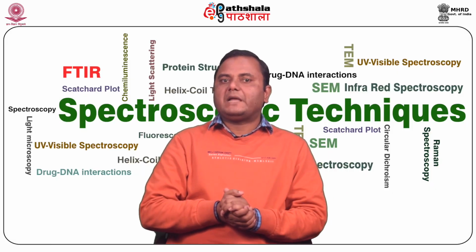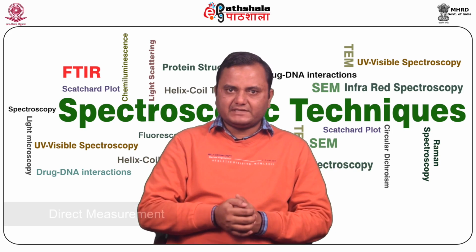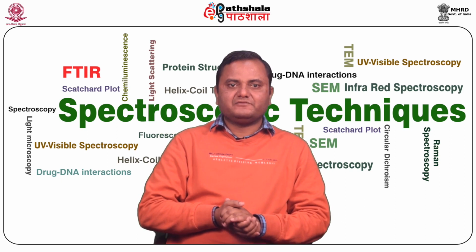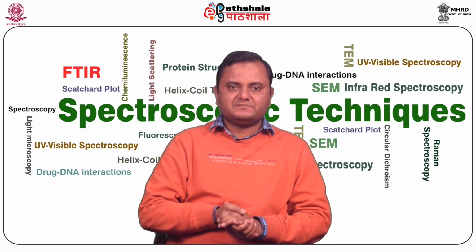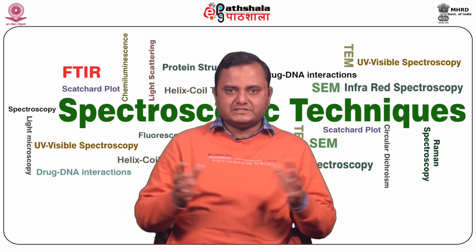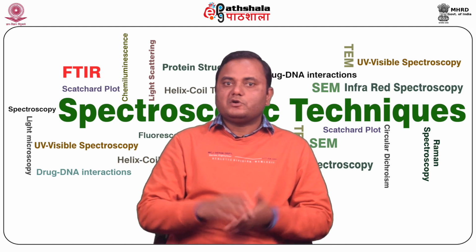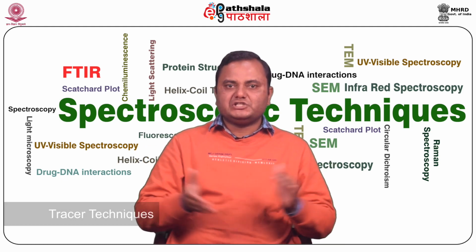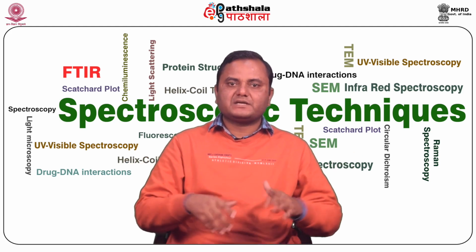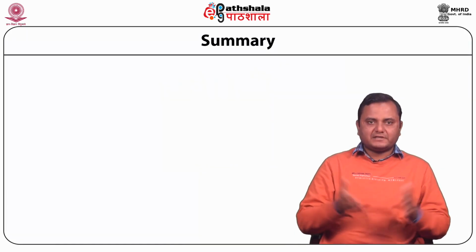Now we discuss the applications of fluorescence. Fluorescence is the most widely used technique. It can be applied to direct measurement, such as metal cations as a fluorescent chelate, and to indirect measurement, where the fluorescence of the substance being determined is measured prior to and after quenching. Another indirect measurement is where the fluorescence of the determined substance is enhanced by the addition of reacting materials. It is also used for the tracer technique, for bioengineering analysis, for fluorescent in situ hybridization (FISH), and for spectral fluorescence signature.